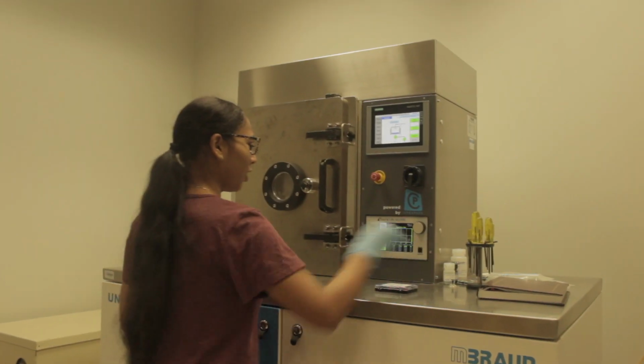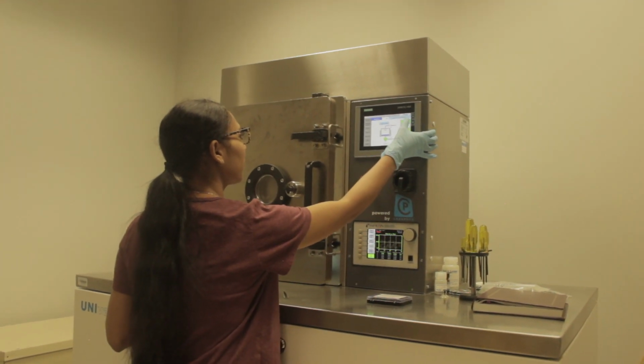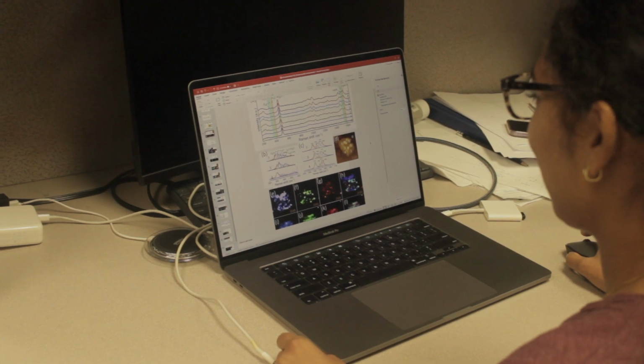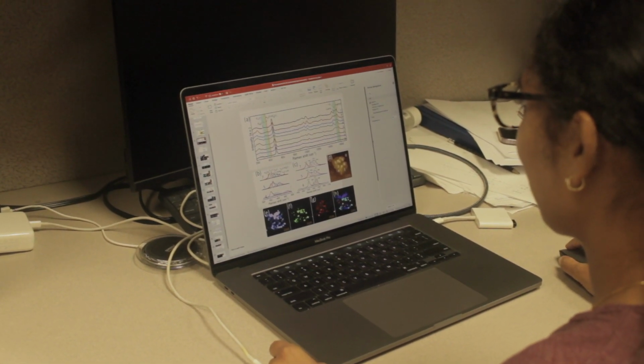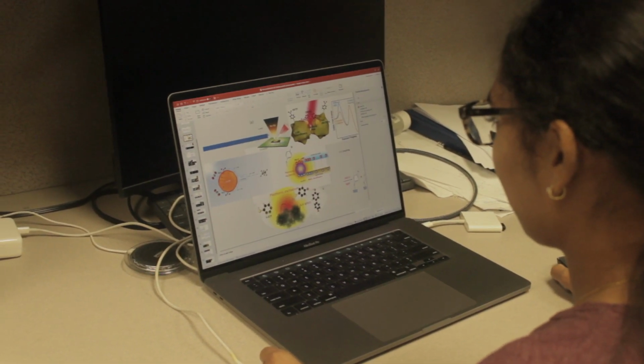Hello, my name is Swati Patel and I'm currently working as a postdoctoral researcher in the Kurouski Lab. My research mainly focuses on the development of nanomaterials for plasmonic-driven photocatalytic applications. Nanomaterials research approaches nanotechnology from a material science perspective, leveraging advances in materials, metrology, and synthesis that emerged in microfabrication research. Our lab prepares plasmonic nanomaterials using different chemical and physical methods.